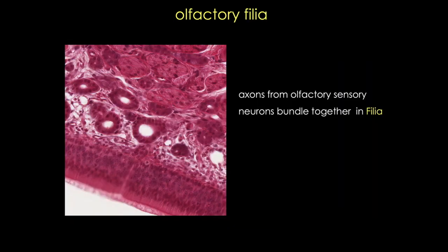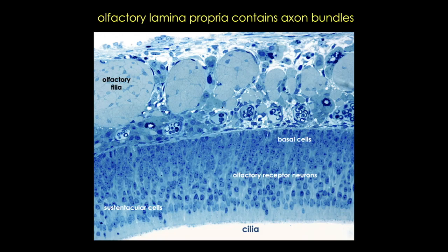This last difference technically isn't in the epithelium, but a difference in the lamina propria. Recall that olfactory receptor cells are actually bipolar neurons, and each one has an axon that will project to the olfactory bulb. Those axons bundle together in structures in the lamina propria called filia, and you can see several of those in this section. These bundles together will form the olfactory nerve, cranial nerve 1. Note the wavy nervous tissue in these bundles — the nuclei that you see belong to glial cells, not to the neuron. This image shows a number of these filia in the lamina propria of this olfactory mucosa.